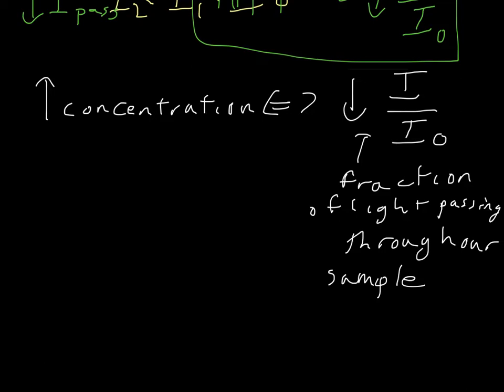We refer to the fraction of light passing through our sample as percent transmittance.